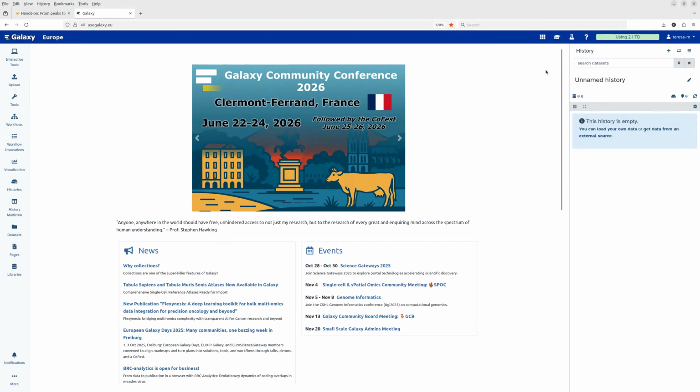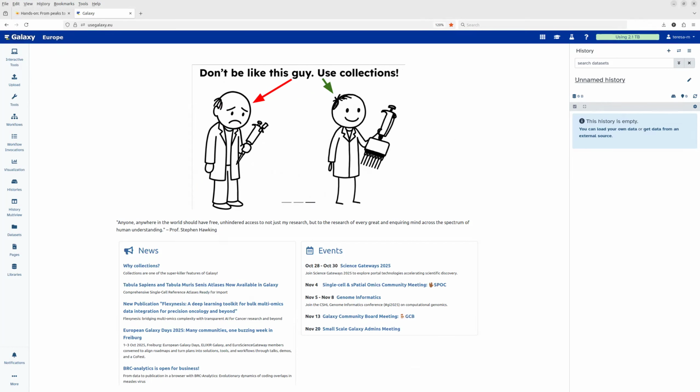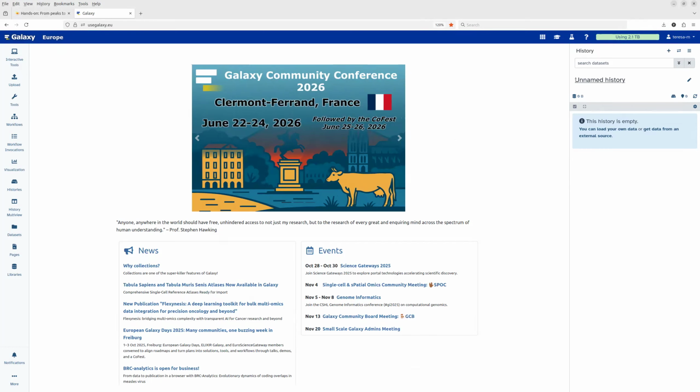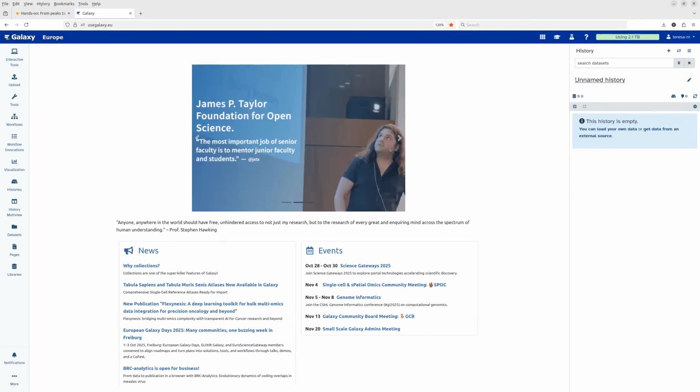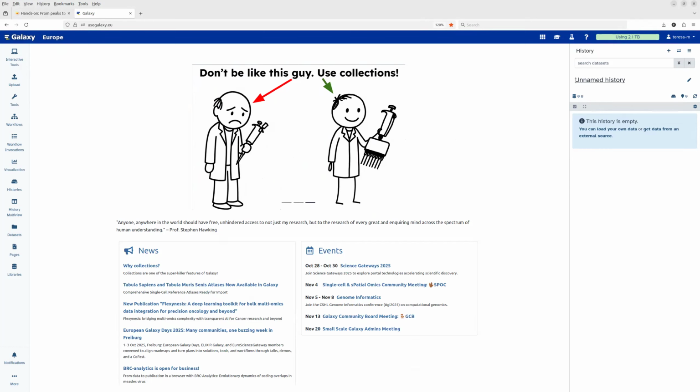On the right side, we have the Galaxy history, where at the moment my history is empty. You might have another history open, or maybe you also see an unnamed empty history like me.